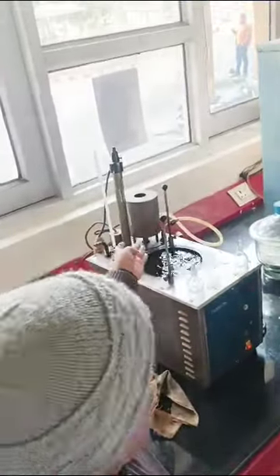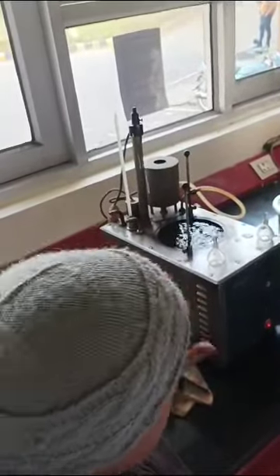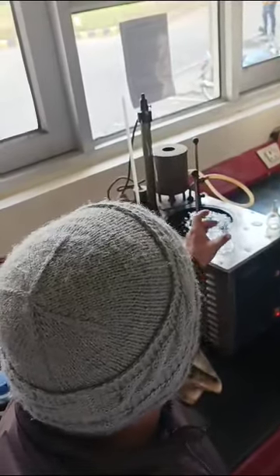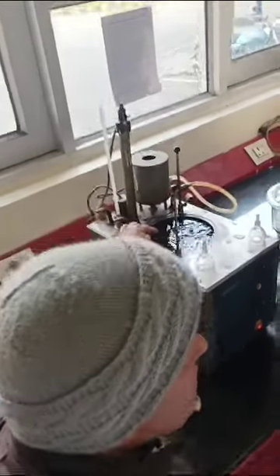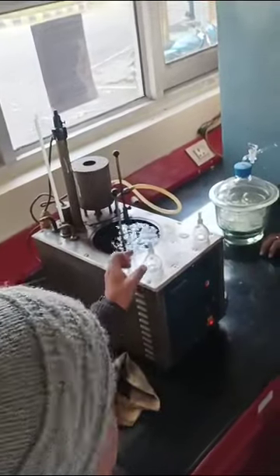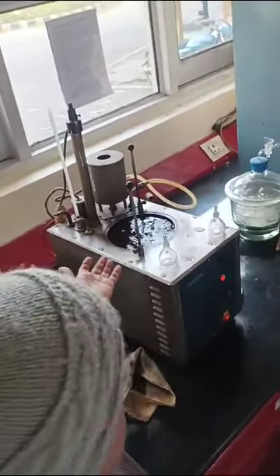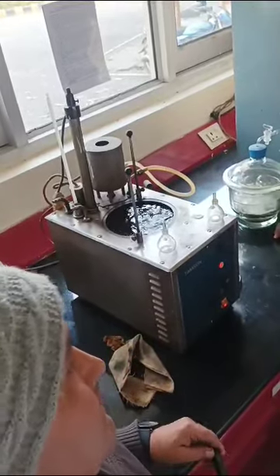sample. Then after filling the water, keep it here at 30 degrees, 35 degrees, whatever you want, and let it sit till there is no gap inside the water, and the excess amount of water should splash out from this. You can see the extra amount of the sample is coming out, because at temperature obviously the volume will expand, so it will cover the whole area of the bottle. And after 30 or 35 minutes, take it out, clean it, and let it come to room temperature. Then again you will take the weight.